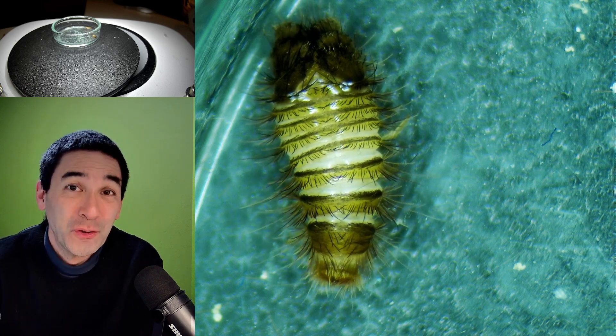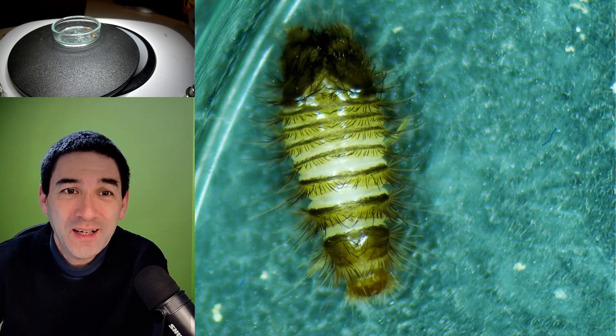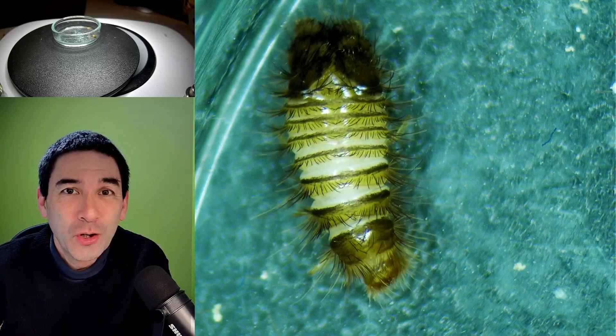Hi, hello and welcome again. I'm Oliver, microbe hunter here. And what you see over here is the larva of a carpet beetle.